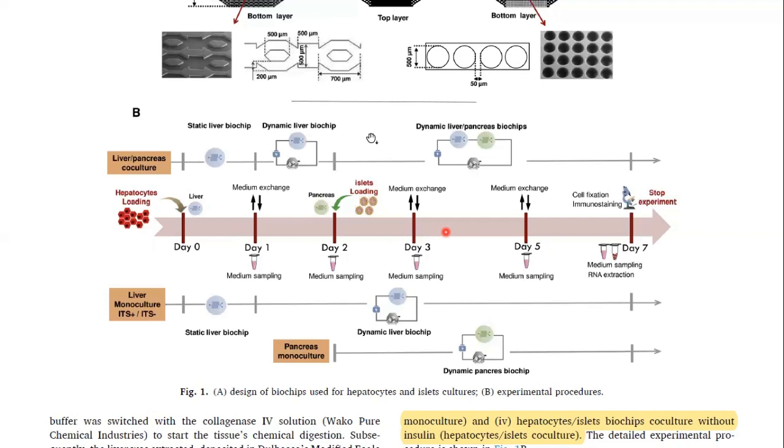The hepatocyte monoculture without insulin led to modulation of both glucose homeostasis targets and hepatic differentiation markers. The coculture with pancreatic cells producing insulin helped recover the hepatic function, illustrating the benefits of the two-organ model. The presence of the hepatocytes in the coculture model helped modify the islet's response via the increase in insulin secretion and the modification of the expression of the genes involved in insulin-glucagon homeostasis. The pancreas-liver organ-on-chip model could reproduce several physiological responses and demonstrated the potential of our approach to reproduce and investigate complex in vivo patterns using alternative in vitro methods.